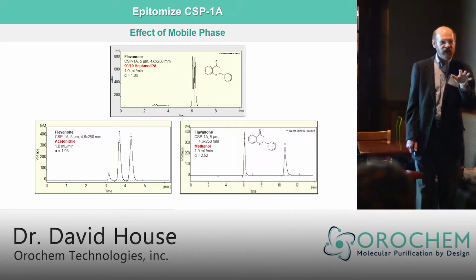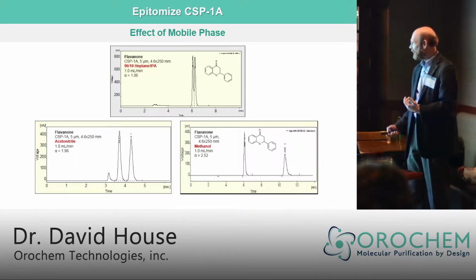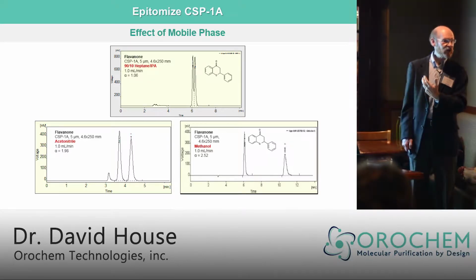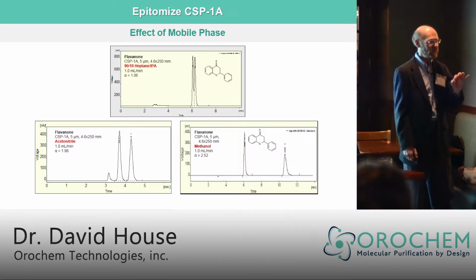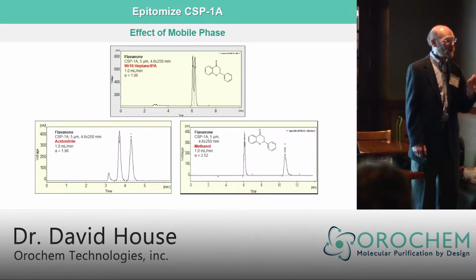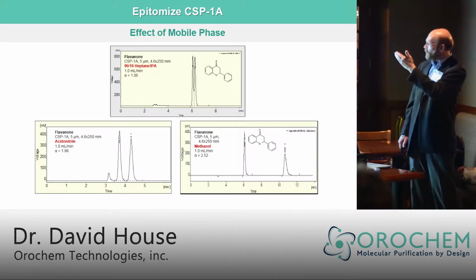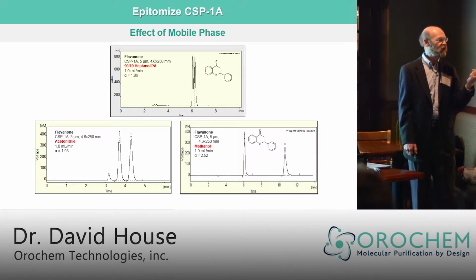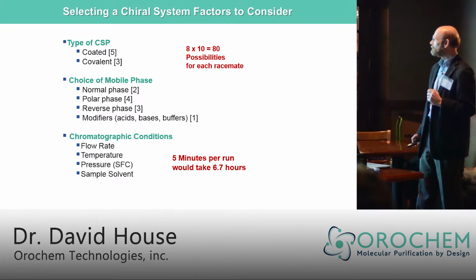In its place is that R group that is bulky. Obviously, this is not going to be a good interaction. This optical isomer cannot approach the chiral stationary phase as closely. Therefore, it's going to be less retained on the chiral column, whereas the enantiomer on the top, being tighter bound, is going to be retained, and that's how we get the separation.